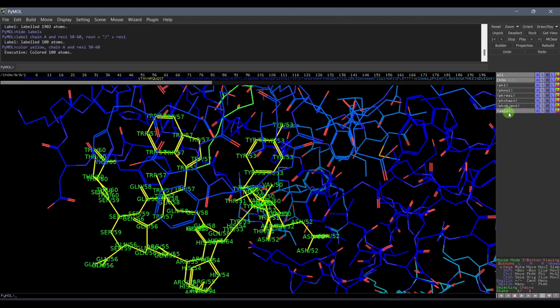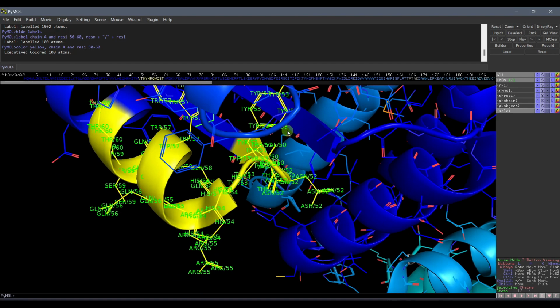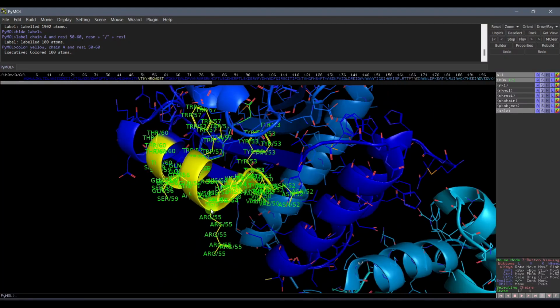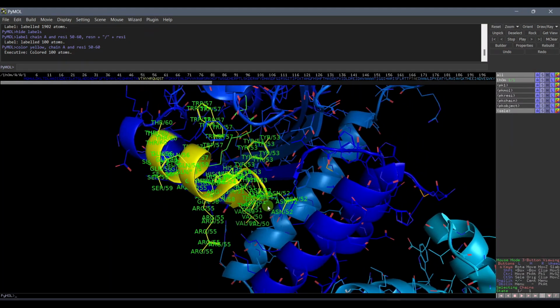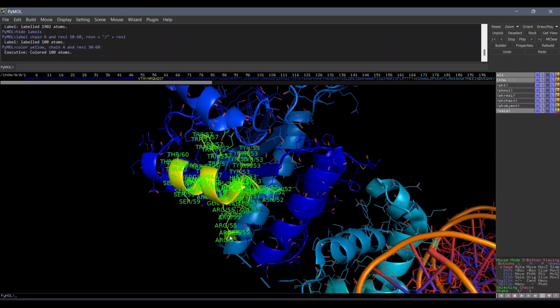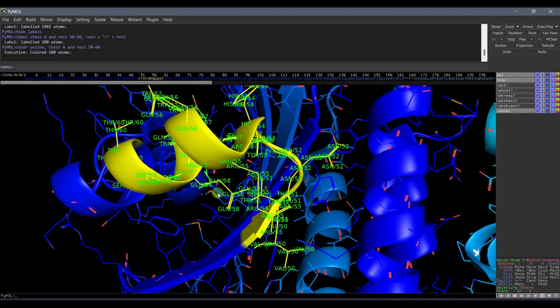And if I show you this, because I've been creating all those things one after another, these are all colored, and if I show this structure as cartoon and hide, yeah, probably you should be able to see this very, very clearly now. So what I've done is specifically highlighted a part of the protein by selecting the residues and also changed the color by a simple command. Look. So maybe you want to highlight this region because there is a conformational change in this particular protein. So you can do this by using that specific command.